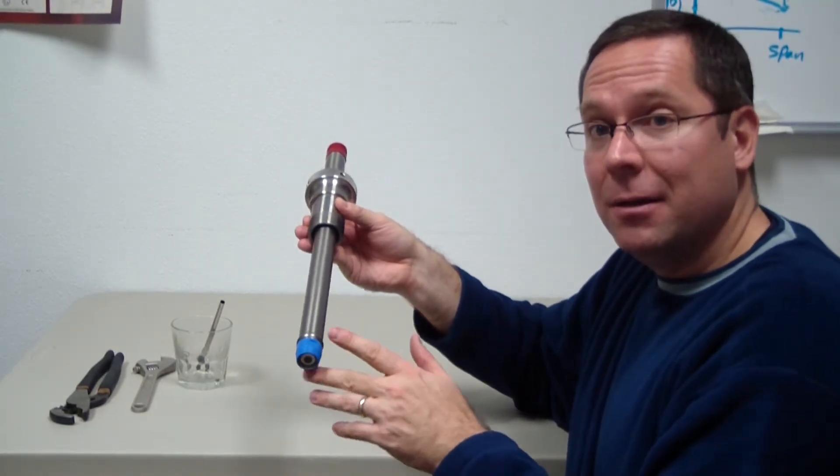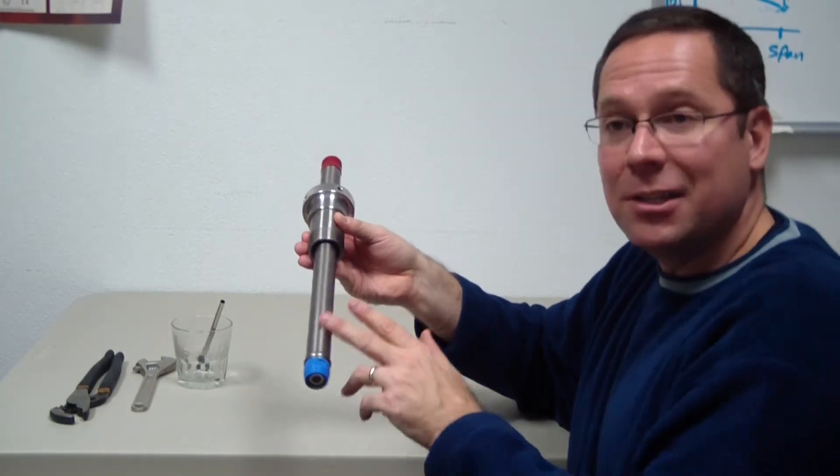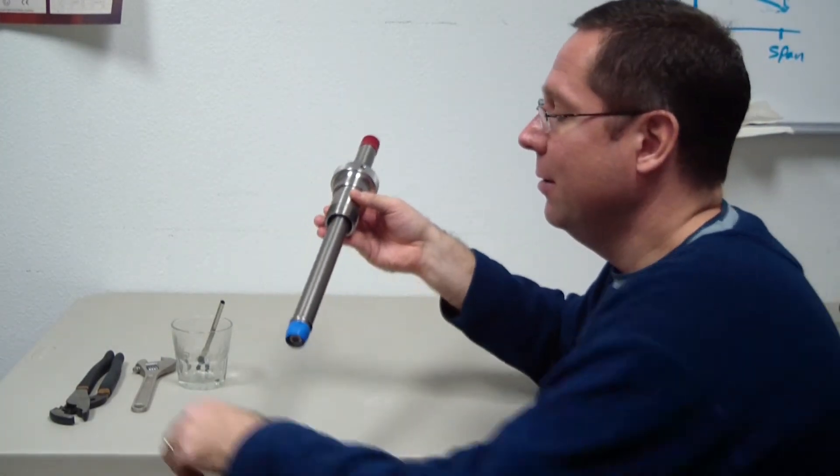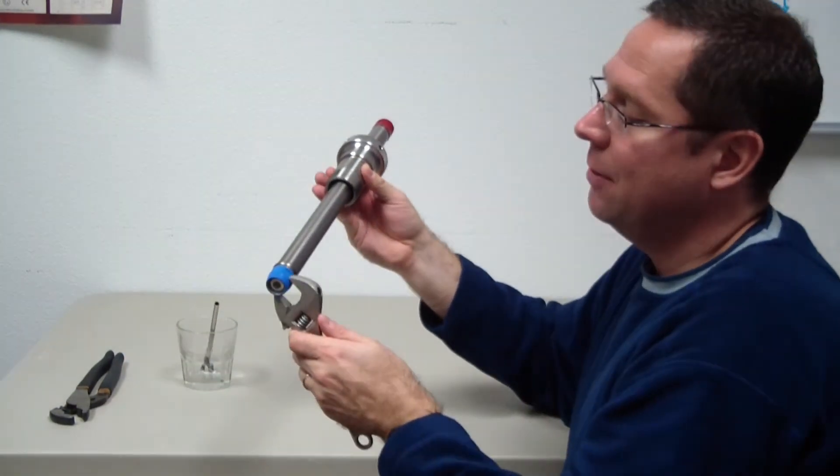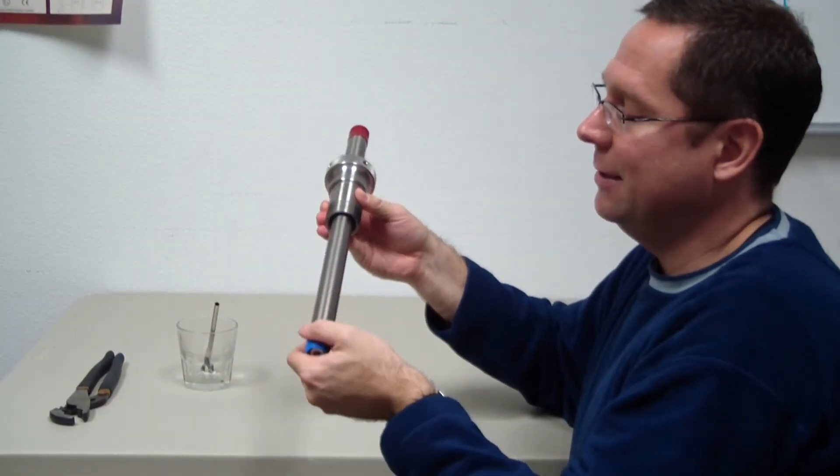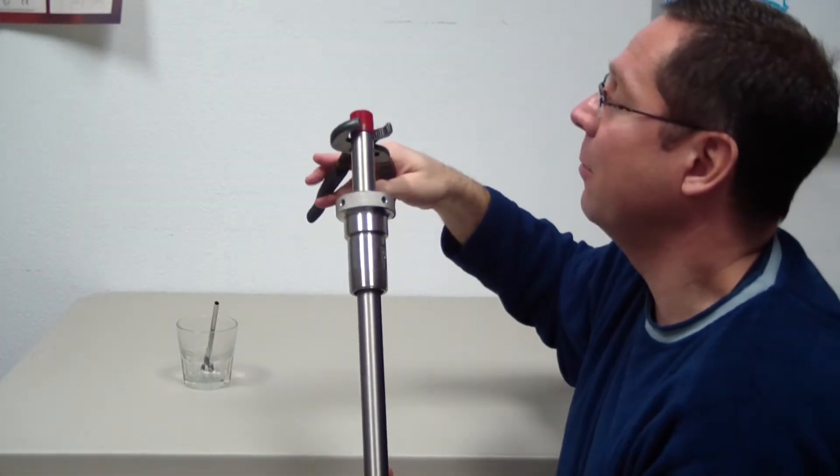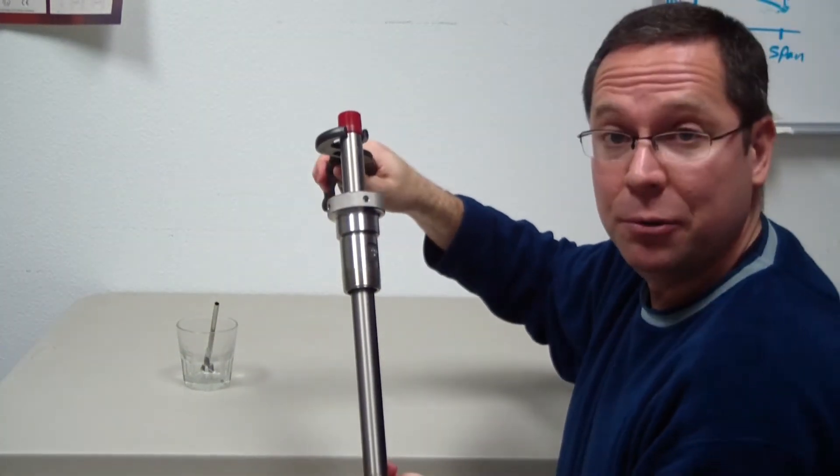For disassembly, if your process gets up into the metallic sheath, the housing here, you might want to take an adjustable wrench. You can put it on the tip here, either loosen by hand, or gently take a pair of pliers to break it loose.